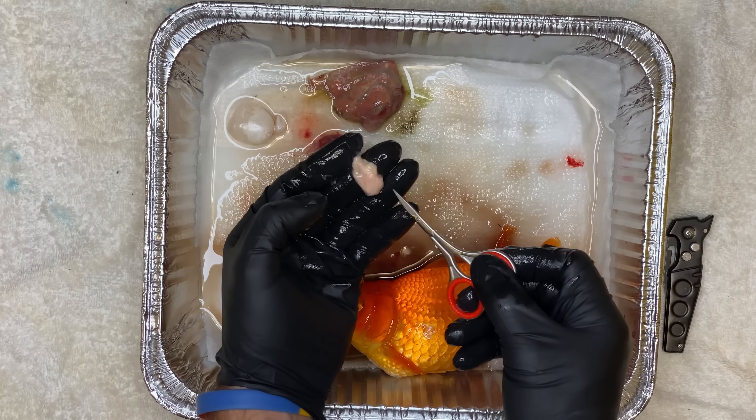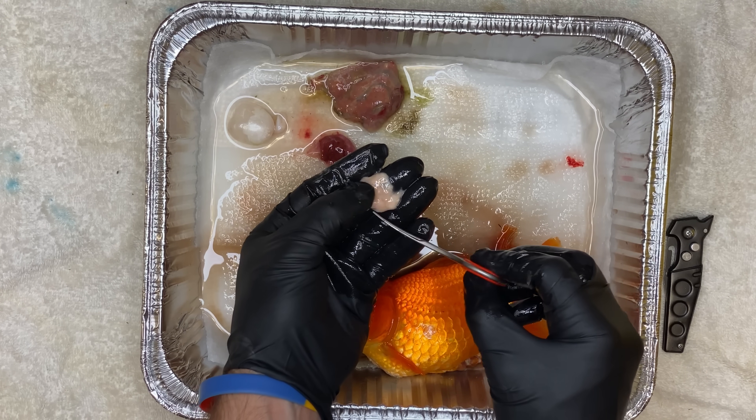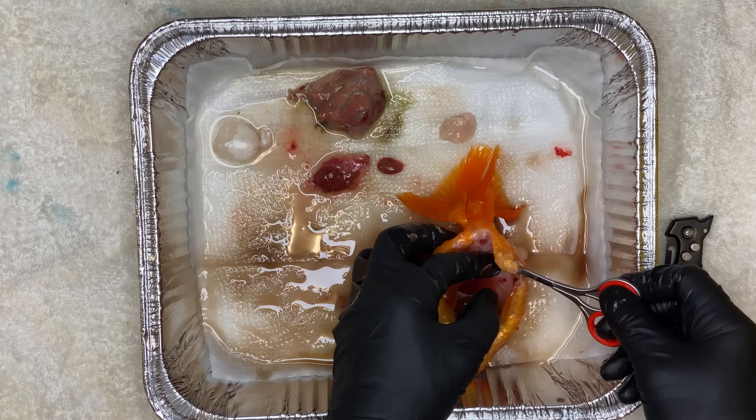The gut looks normal, but the reproductive tract, as I showed before — this is the part that looks weird. It looks like an empty sack. It looks like it was full of fluid, but now it's ruptured and there's nothing left.